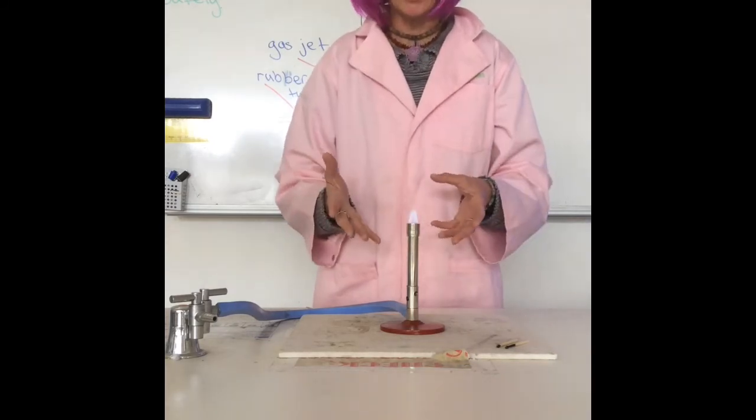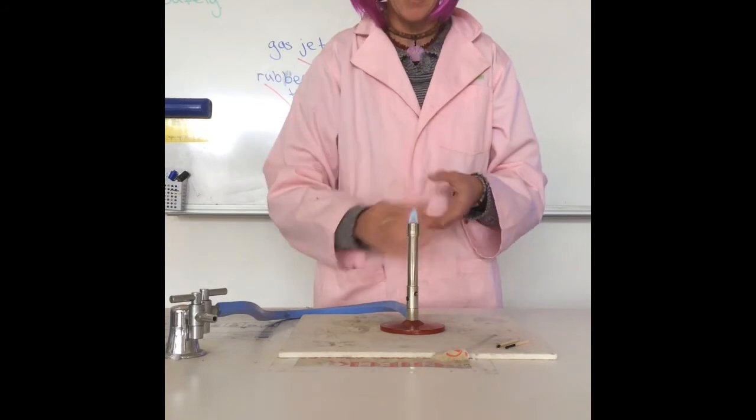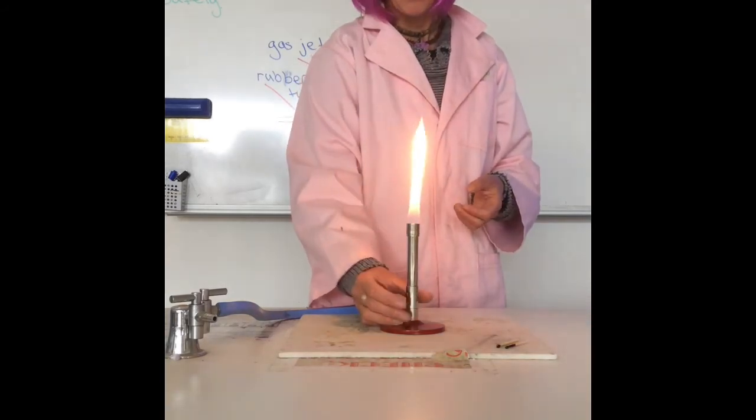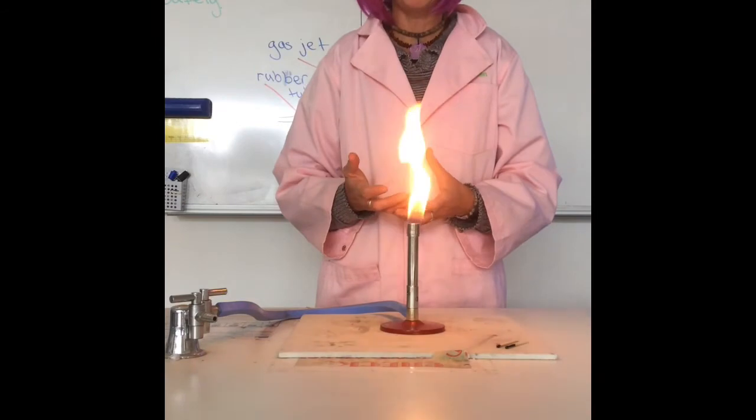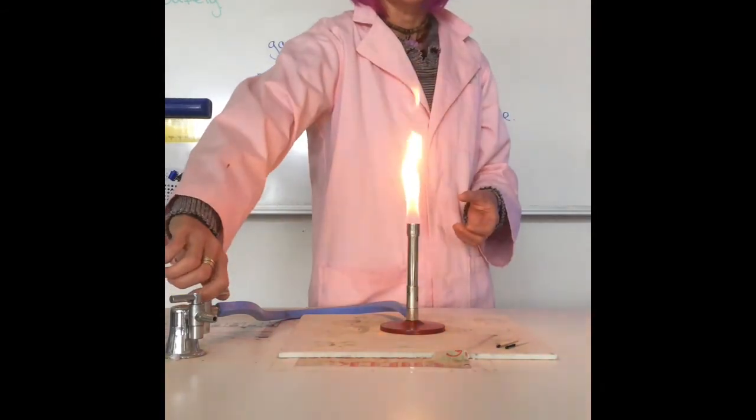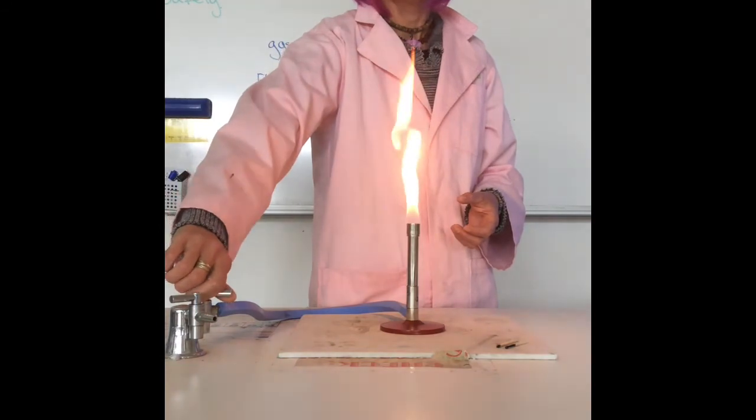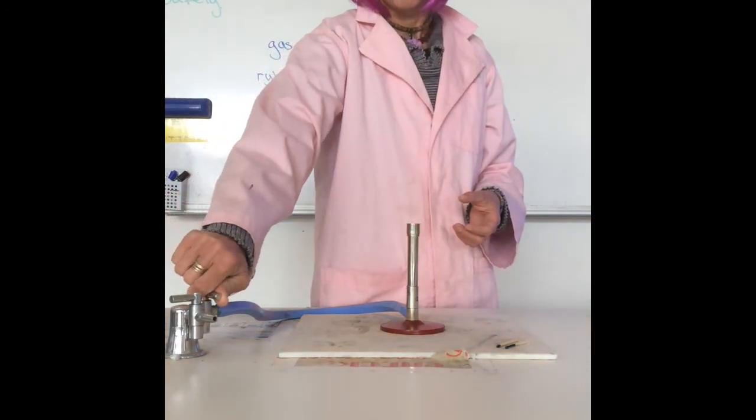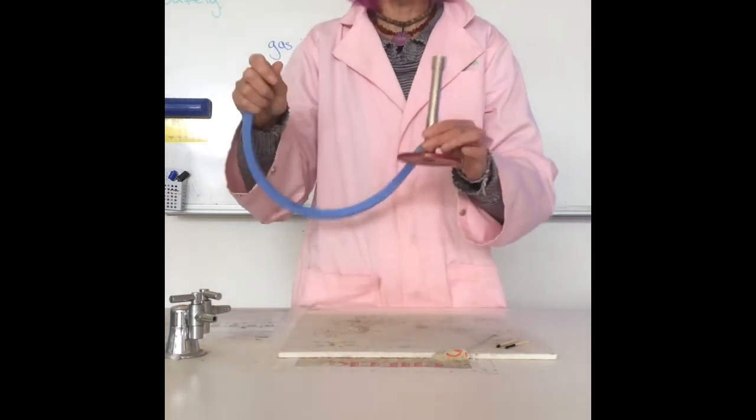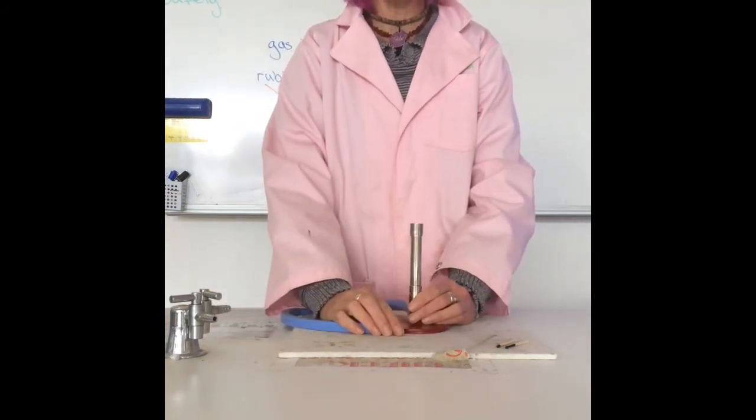Once you've finished heating your substance, it's time to put your Bunsen burner back on the safety flame. There we go. And we can now safely turn off the Bunsen burner. So I'm going to turn the gas tap off. And there we go.